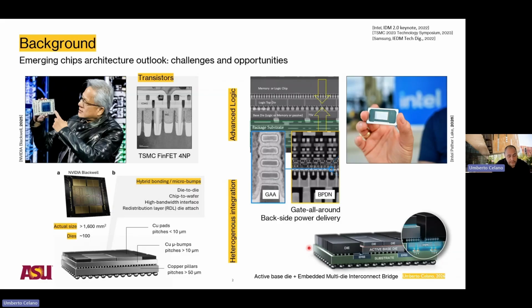So the reason why I like to show this slide is that on one hand, it shows in essence what are the key metrology challenges that we are facing. So the metrology challenges are here: complex architecture, three-dimensional in nature, a lot of wires and a lot of different materials that are used for the first time in many cases, because actually some of the engineering challenges here had to be overcome with some new solutions in terms of architecture and material integration.